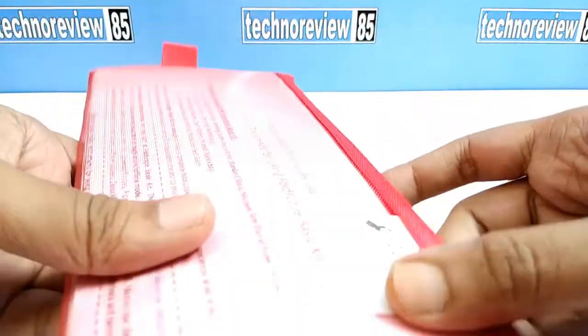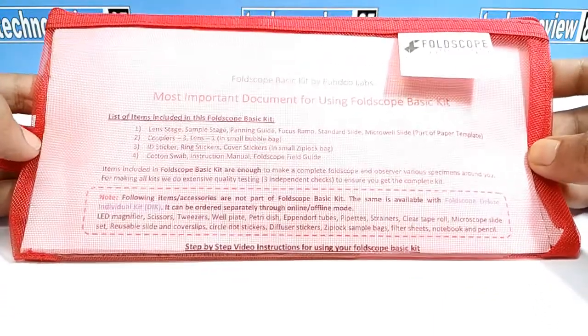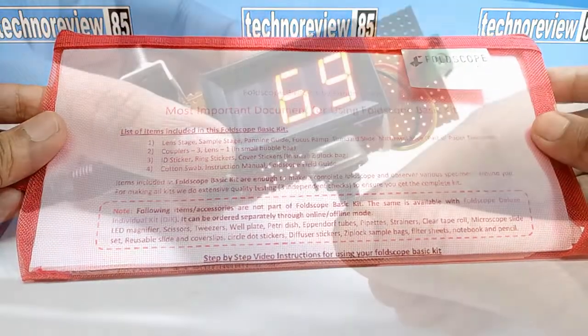Dear friends, in this video I am going to show you a paper microscope. But don't think it is a toy. I am wondered by testing its performance. So let's get started.